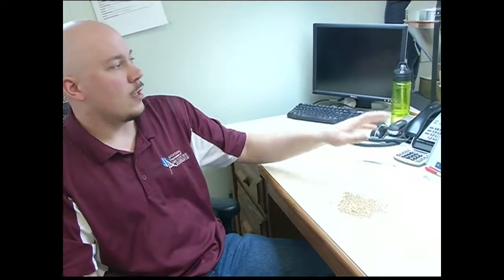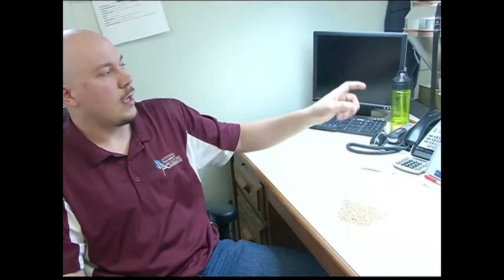And we will break down every sample basically the same for each commodity. That way each inspector will break it down the same, and that would be the same as the people in Kansas City, the people in Oregon that are federally licensed. That is our goal, to provide non-biased quality inspection for each sample that comes across our desk.